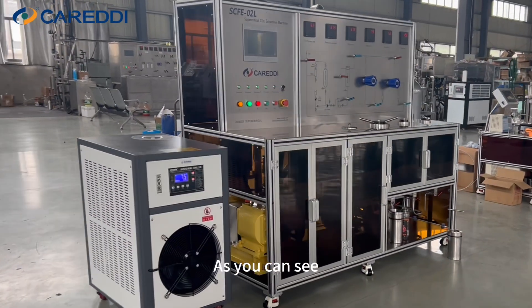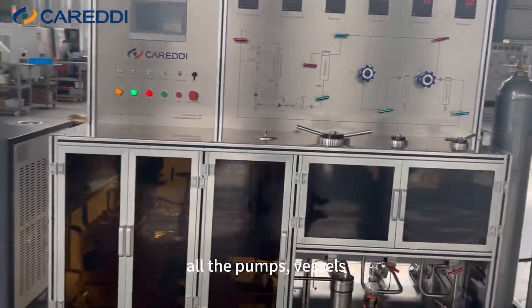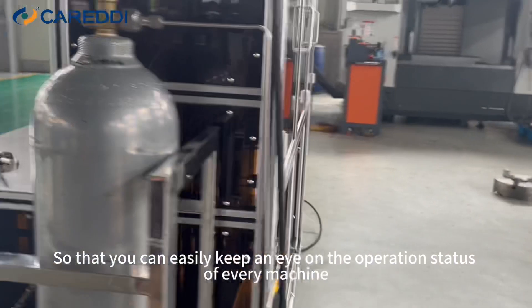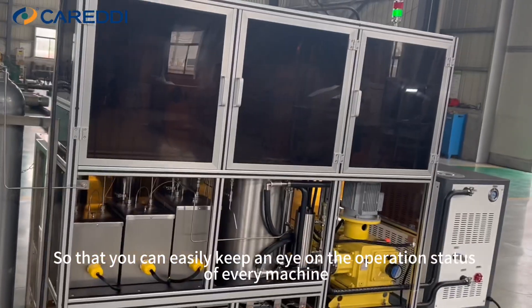As you can see, it's very compact and delicate. All the pumps, vessels, and pipelines are well placed behind the transparent acrylic sheet, so that you can easily keep an eye on the operation status of every machine.